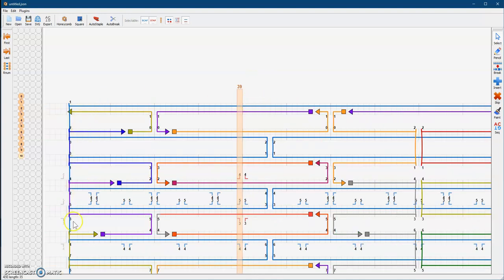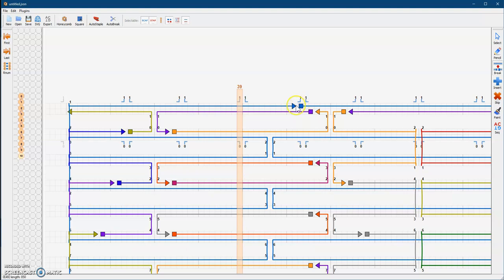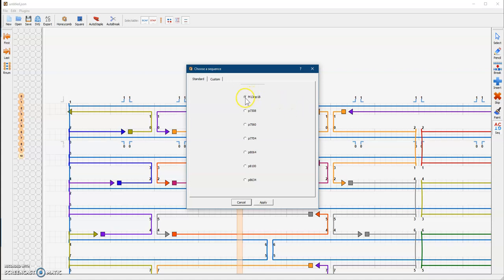To add a sequence, first you have to break the scaffold strand — the blue part. This break doesn't actually translate to the real world for the scaffold strand; it's just a place where the sequence can start. We hit the break tool and click on a position. Now we have a three prime end and a five prime end — the five prime end is the square and the three prime end is the triangle or arrow tip. We hit the sequence button and go to the five prime end. Because we're working with M13 bacteria, we select that sequence, which is the one most DNA origami uses, and then hit apply.